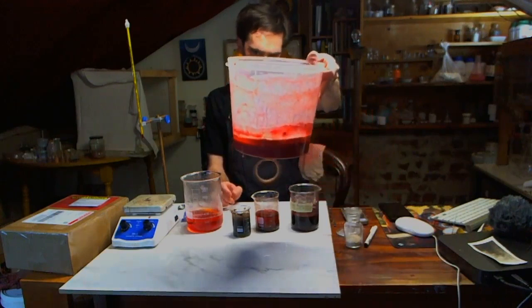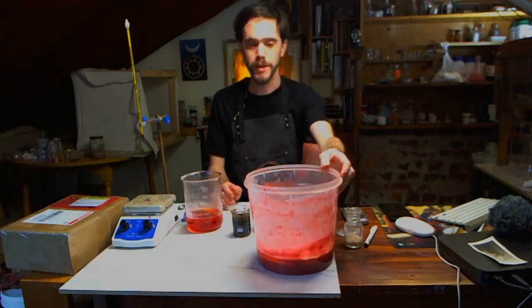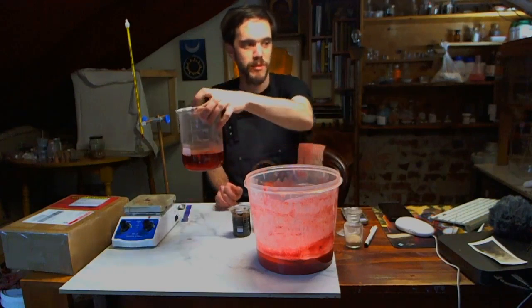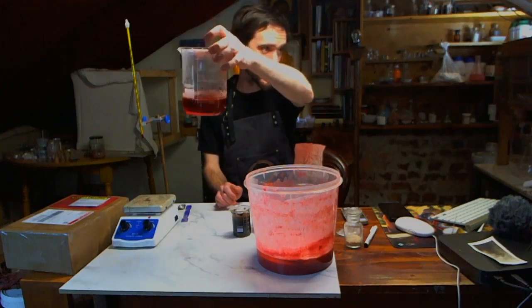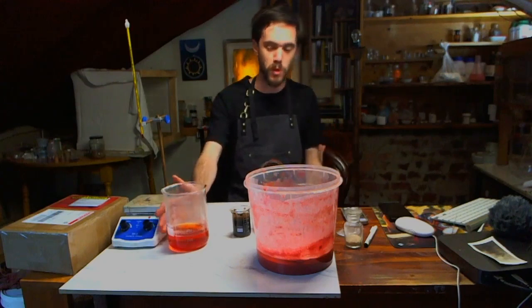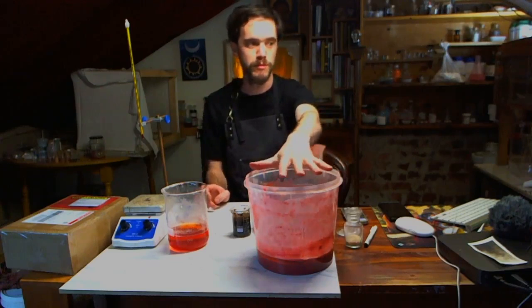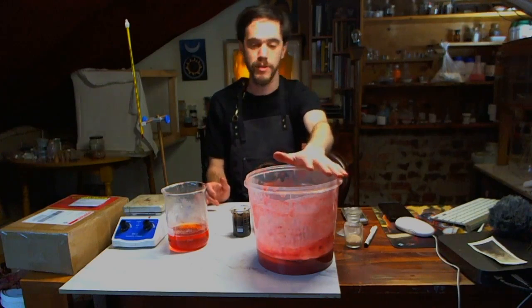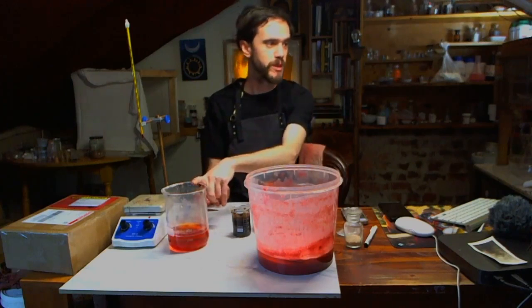So this is what we have left over from yesterday. I started draining off a little bit of the liquid after the foam dropped back down. This is some of the liquid that I've drained off, which, as you can see, is still quite red, quite nice, which means that there's definitely still some more colouring material that we could get out of this. But what we'll do is we'll filter off the pigment from here, and then once we do that, we'll try and do a second extraction from the leftover liquid.